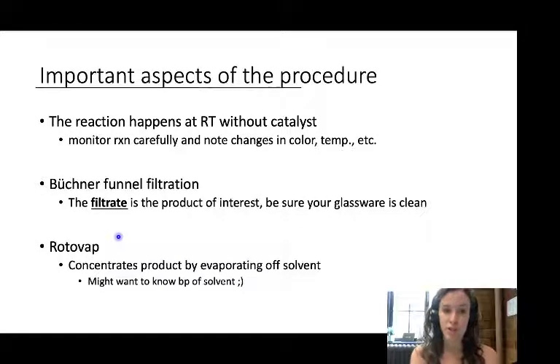Let's talk a bit about the procedure. This reaction will happen at room temperature for 15 minutes without a catalyst. I want you all to think a little bit about what this means in terms of whether or not the reaction is favorable and maybe what the activation energy might be for such a reaction. In particular, as always, but particularly this week, let's monitor the reaction carefully and note any changes in color or any changes in temperature of the mortar and pestle while the reaction proceeds.